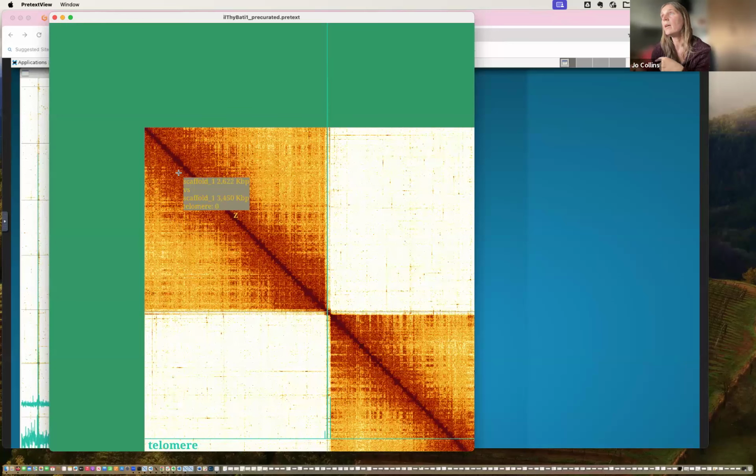Often it's only once you've looked through those primary units that are already constructed, and looked to see whether they are assembled correctly, that you can properly insert the small scaffolds that should be part of your chromosomes. But that depends. Sometimes you can insert them easily if it's just a case of a simple gap. Other times it needs a bit more work in sorting out the assembly before you can construct the chromosome as it should be.